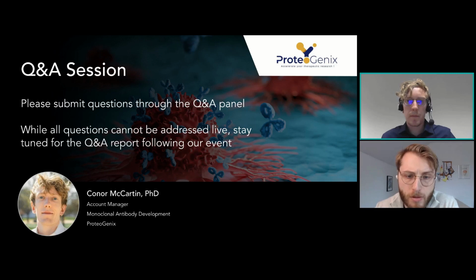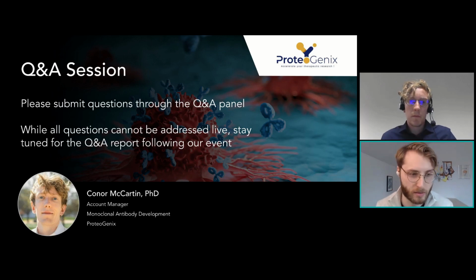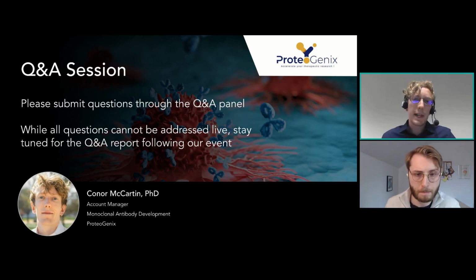Excellent. Question here about storage. How long can the phages be kept at -80, and how many times can they be thawed and frozen before they lose their infectivity? If we store them at -80, we have to store them as a glycerol stock, and this can go from 6 months to up to a year.